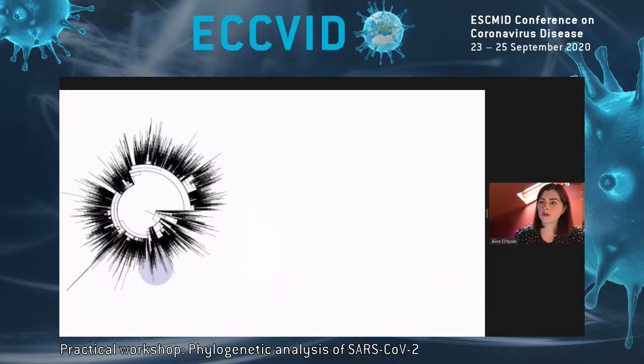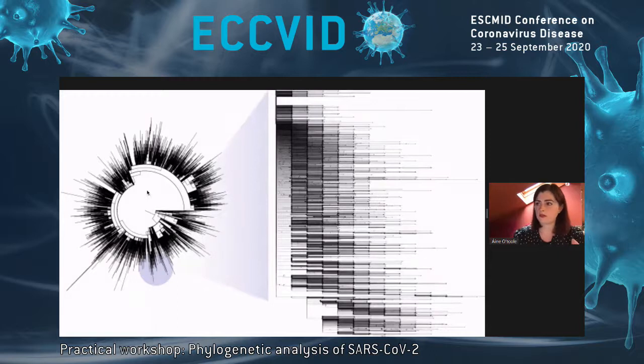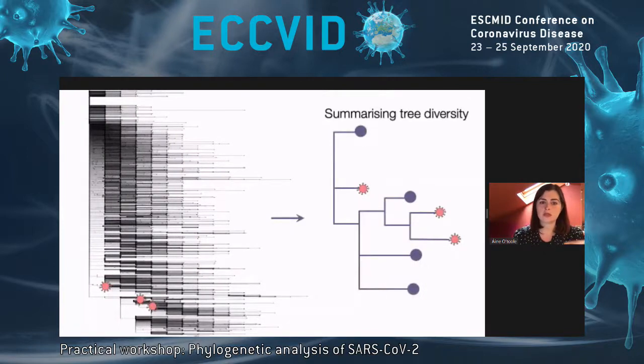So just as an example of how it works, we have the large tree where we identify where the sequence of interest exists. We pull out this local tree. So even though this tree on the right now looks quite big still, it's a lot smaller than 100,000 tips. And then based on the sequences of interest, we summarize the rest of the diversity in the tree.